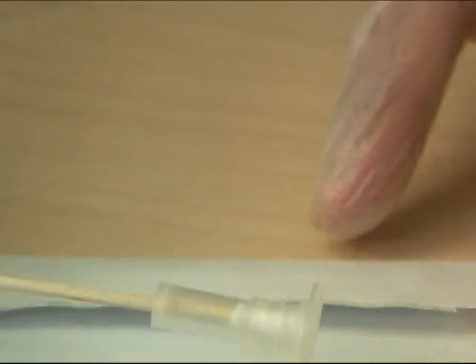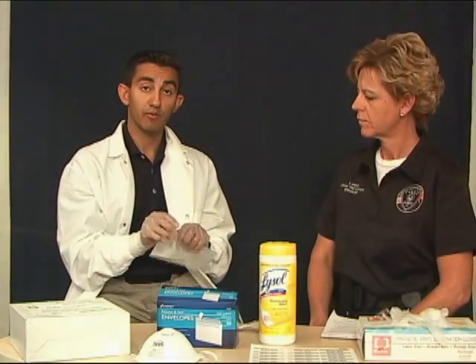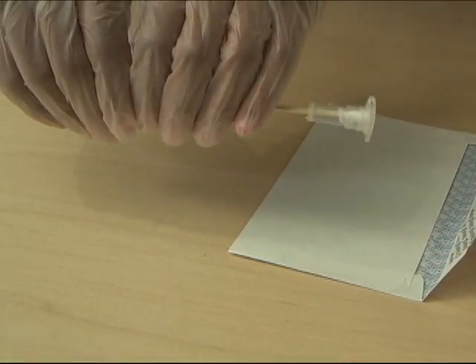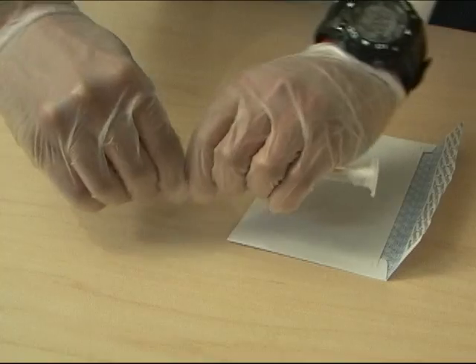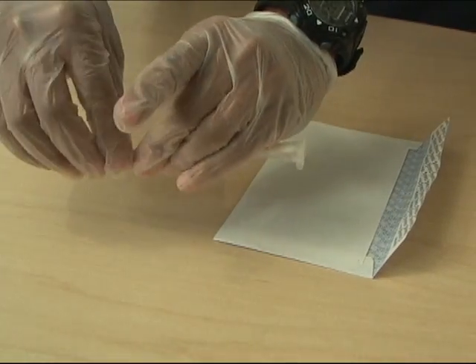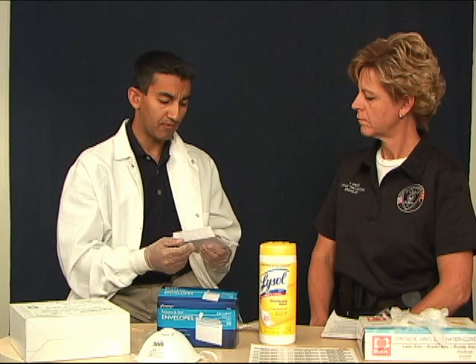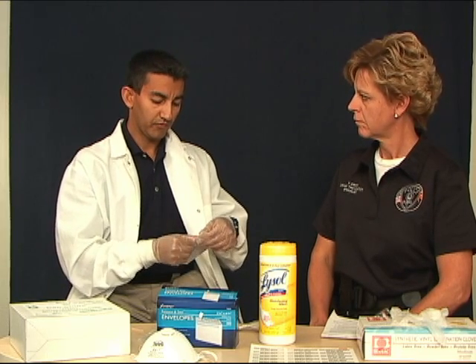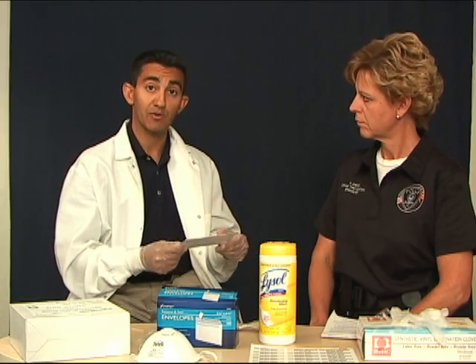Again, we're going to use a self-sealing envelope because we don't want to lick the envelope. If the stick is too long for the envelope, we're just going to break it off. And just to demonstrate, I'm going to do just that. Another thing is it's also important to keep with your envelope the instructions of how you collected this DNA sample. Were someone to come across this kit that you handed off to, it's important for them to understand exactly how it was collected, whether it was ambient or not.